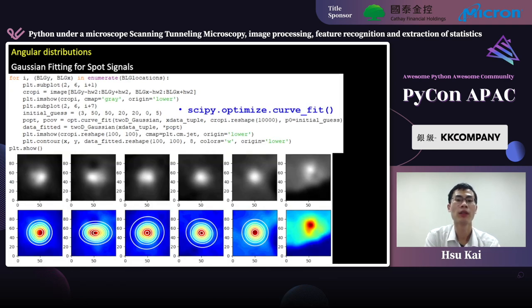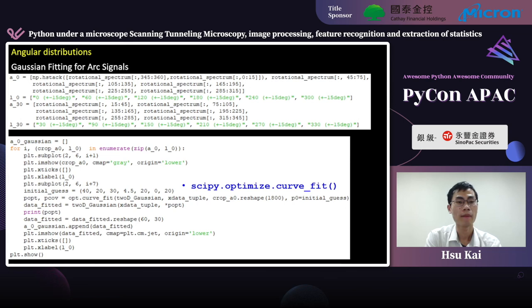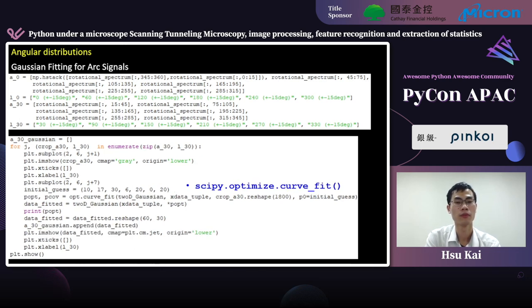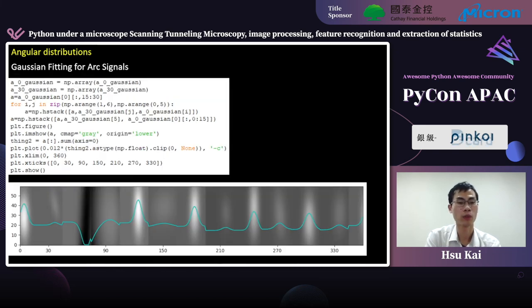And after that, I use curve_fit from SciPy optimize to do the fitting for both spot signals and arc signals. I gave a plus minus 15 degree range at those characteristic angles. We cannot go more than 15 degree, otherwise the signals from two different domains will overlap. After Gaussian fitting, we can get a similar intensity versus angle plot. And as you can see, the peaks still locate at those characteristic angles, but the peaks get rounded.